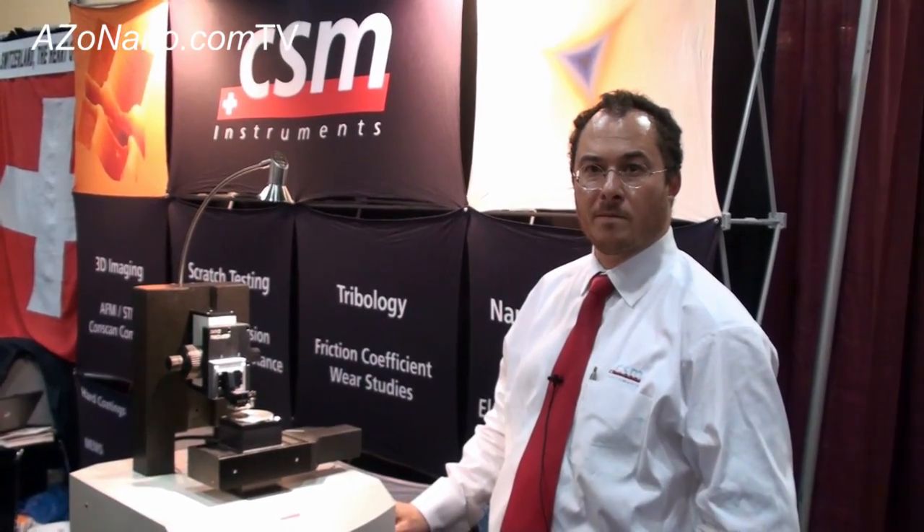This is Cameron Chai from azonano.com, bringing you another episode of azonano.com TV. Today we're speaking to Nicholas Randall from CSM Instruments and he's going to tell us about their new nanotribometer.